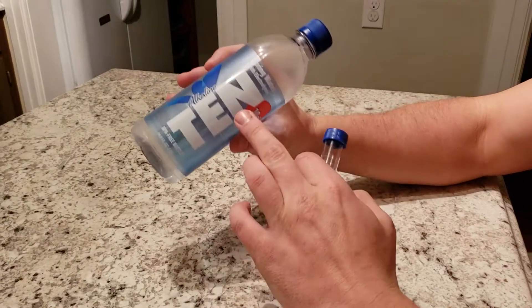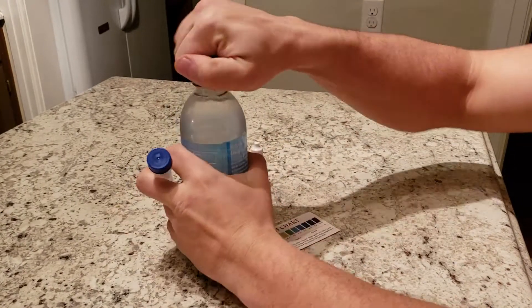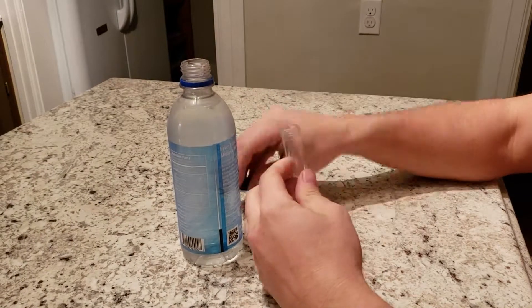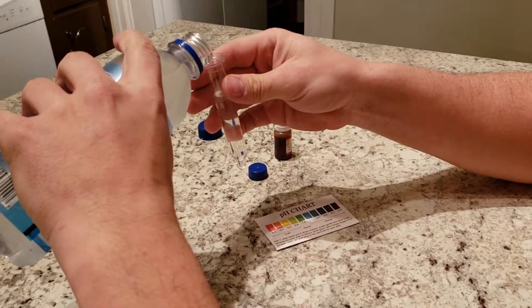All right, back again with another pH review. This is Alkaline 10, claiming a 10 pH. I bought a six-pack of this water, and it is actually delicious. It's becoming one of my new favorites, but I have not tested the pH to see if it's accurate. So let's do that now.